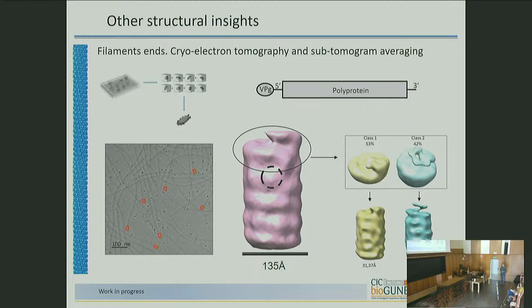Well, the helix more or less you can guess what it is, even sometimes a globular region, one nucleoprotein, so to speak. And we did several trials, different types of processing, and the only result that came out several times was this one, more or less 50%. You have one or the other.